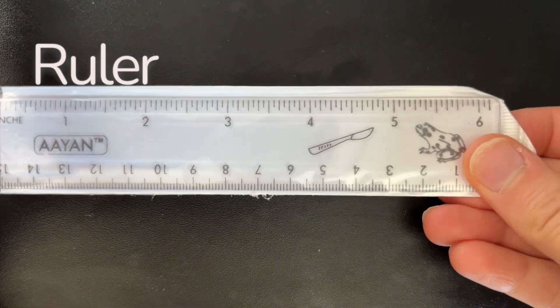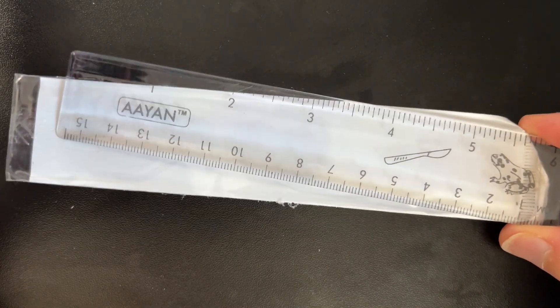First, your dissecting kit may come with a ruler. This tried and true simple tool is used for measuring different parts of a specimen, especially if you're doing data collection or taking any types of measurements. Your kit may have a ruler or it may not, or your teacher may give you a paper one, which is also commonly used in kits.